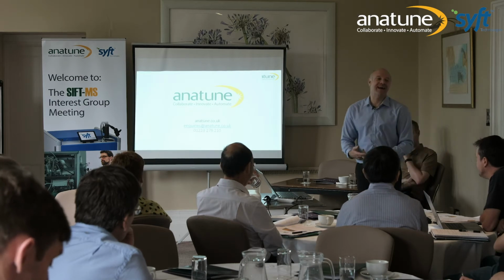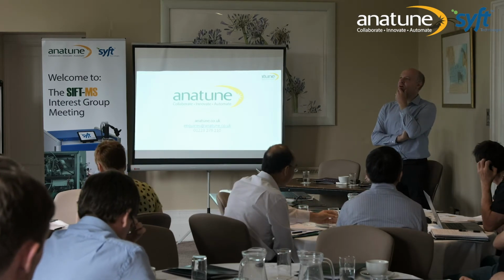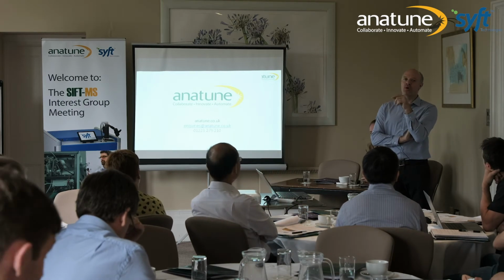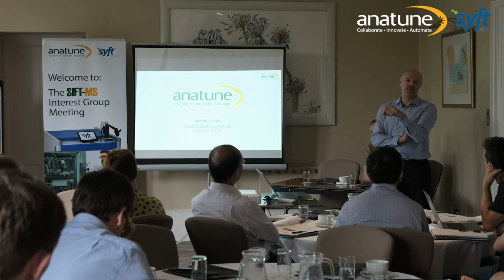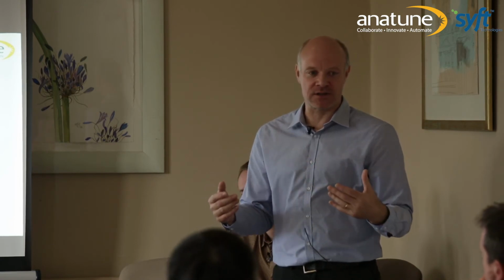Well, I don't know. Basically, if you do have a conflict in the library, then I suppose you're going to have to do some more work on your method in the first instance, understanding your matrix, and then proving to yourself and those people who need to be proved to that the likelihood of this conflict appearing in your matrix is so low as to not be a problem. But it's like anything. You can do your specificity on a GC method and look for co-elutters and such like, and they're not there. But there's always a possibility that you get a sample coming through that is slightly odd, and you have a co-elution that you don't know about.